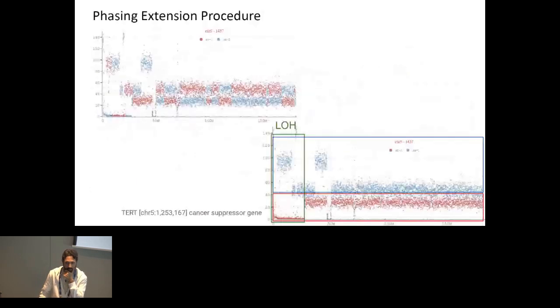Yeah. Here, on the bottom right is what Vahan produces. This is the initial Vahan phase correction output. Yes, but have you seen examples like the top left, where there's a switch between these haplotype segments? Yeah. And can Vahan detect it?